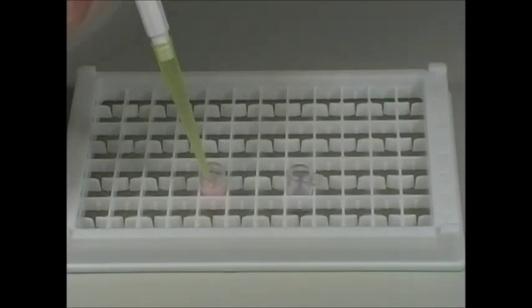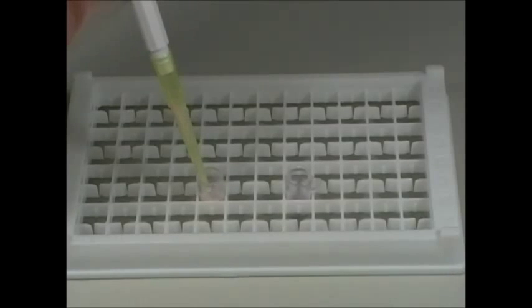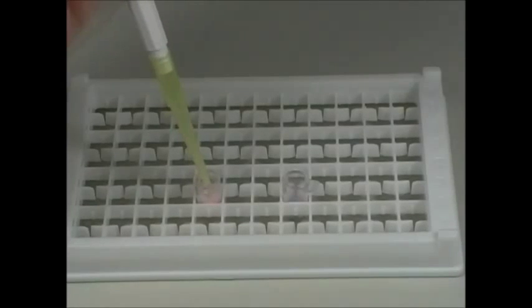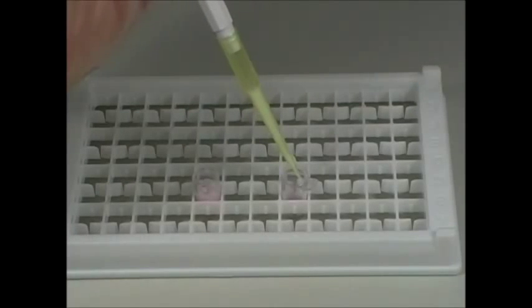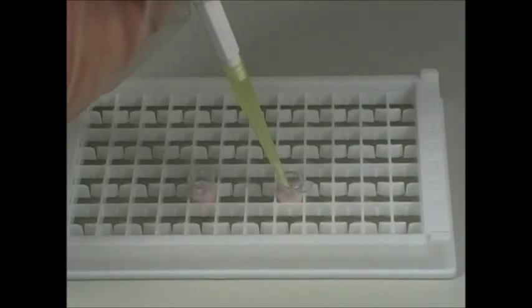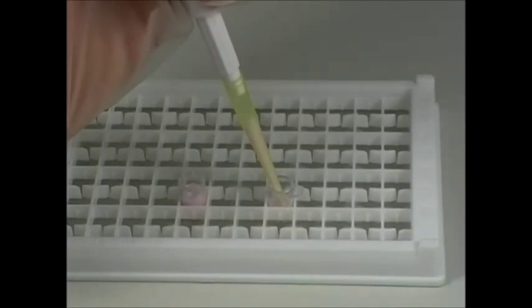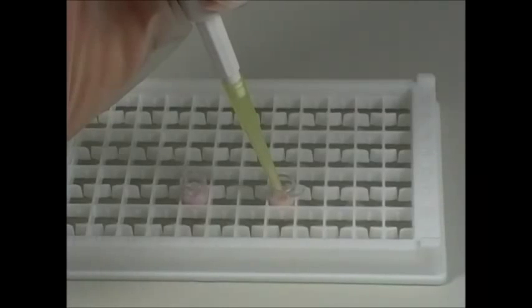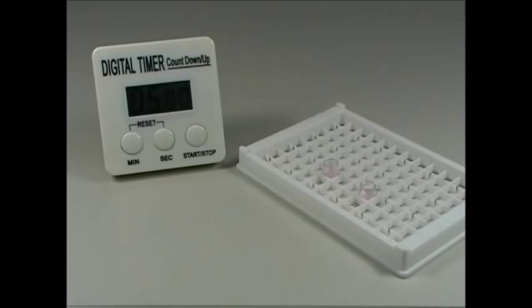With the same pipette, aspirate and dispense the liquid in the microwell about 8 to 10 times. Then, incubate for 5 minutes at room temperature.